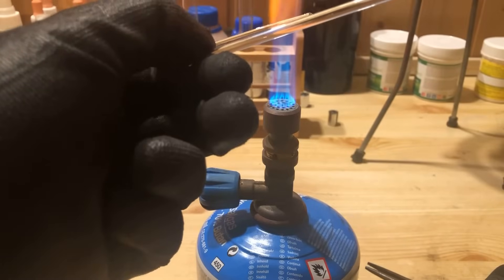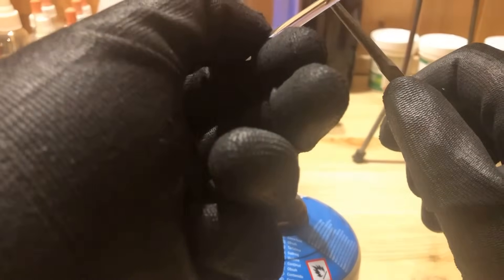The zinc disc holder was made from a 4 mm diameter borosilicate glass tube.